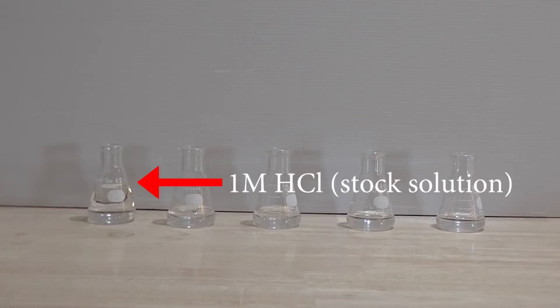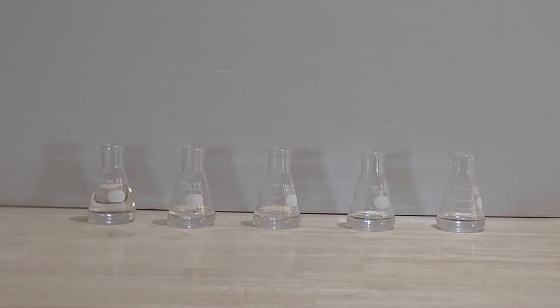The 1 molar hydrochloric acid is referred to as the stock solution. The dilution factor in this experiment is 10, and the amount of standard volume of the acid that is pipetted into a measuring cylinder is always 1 ml.